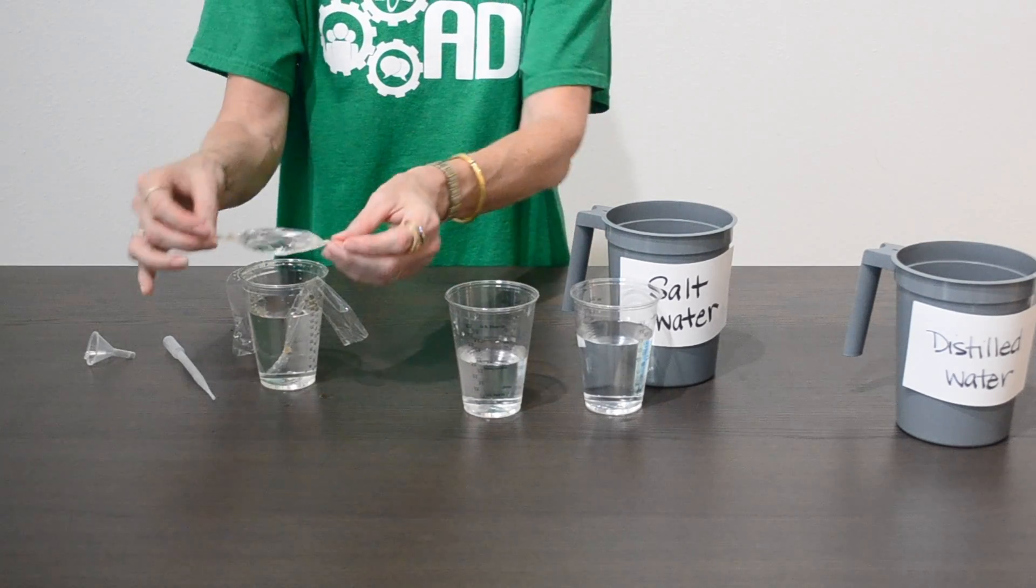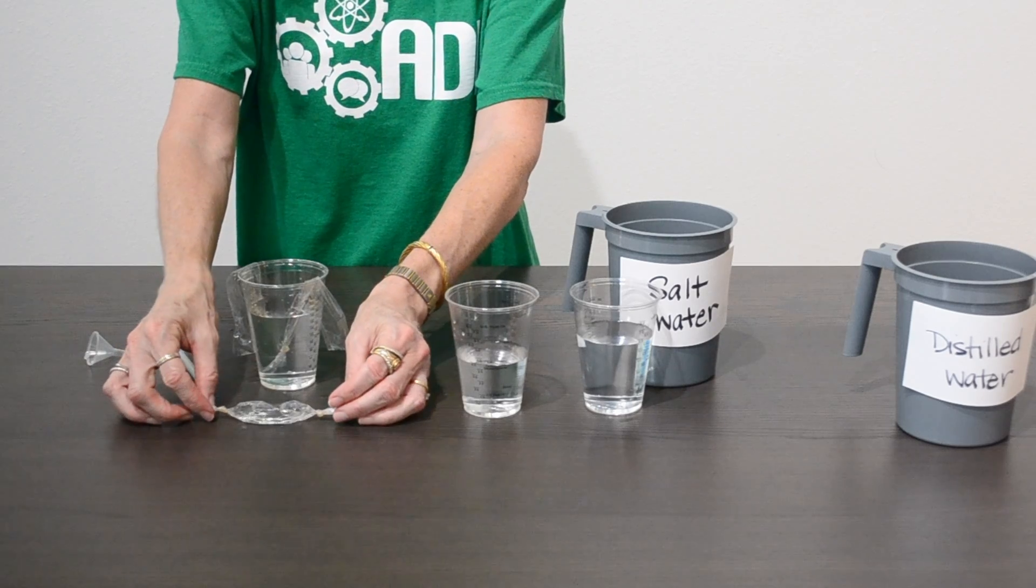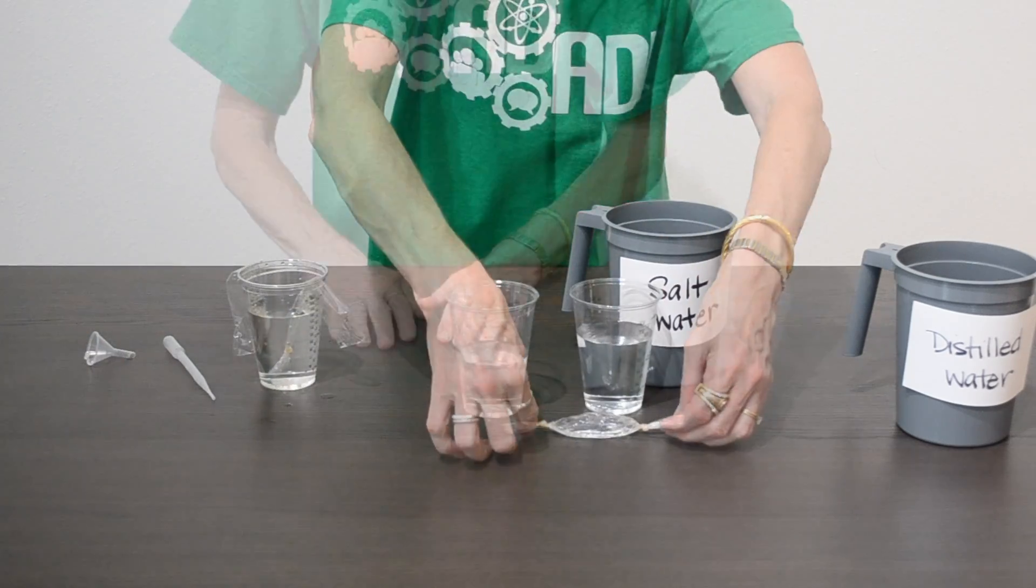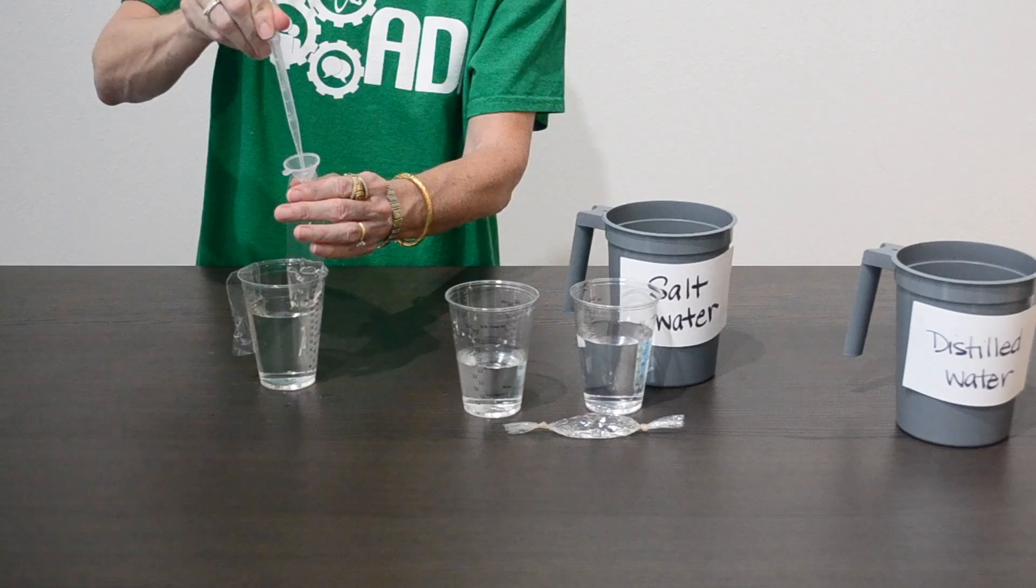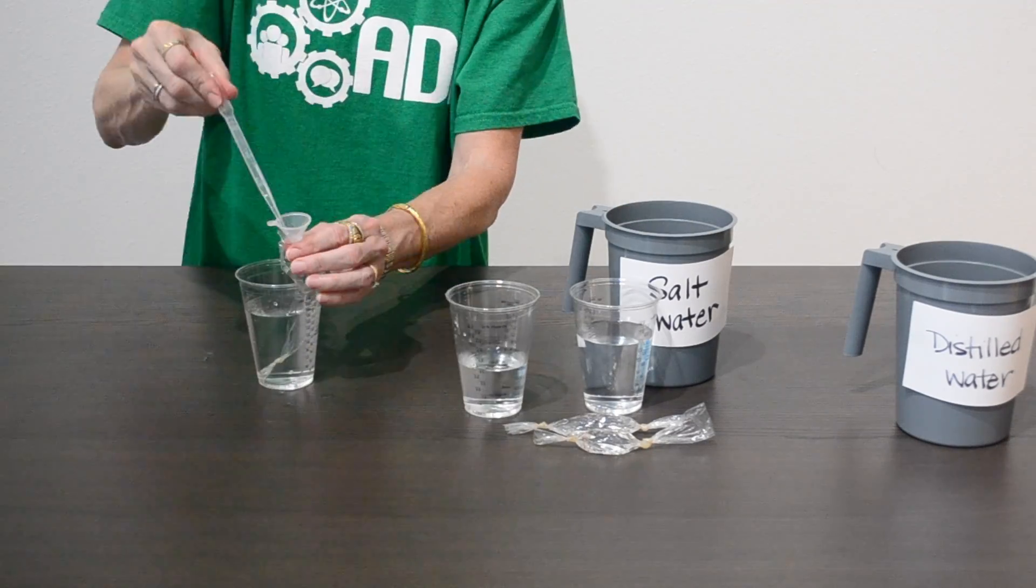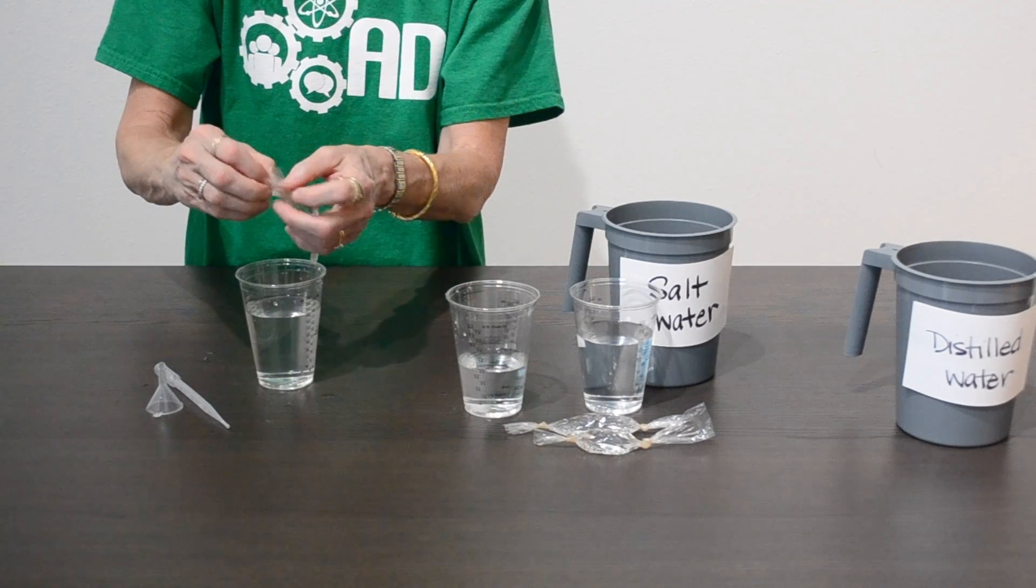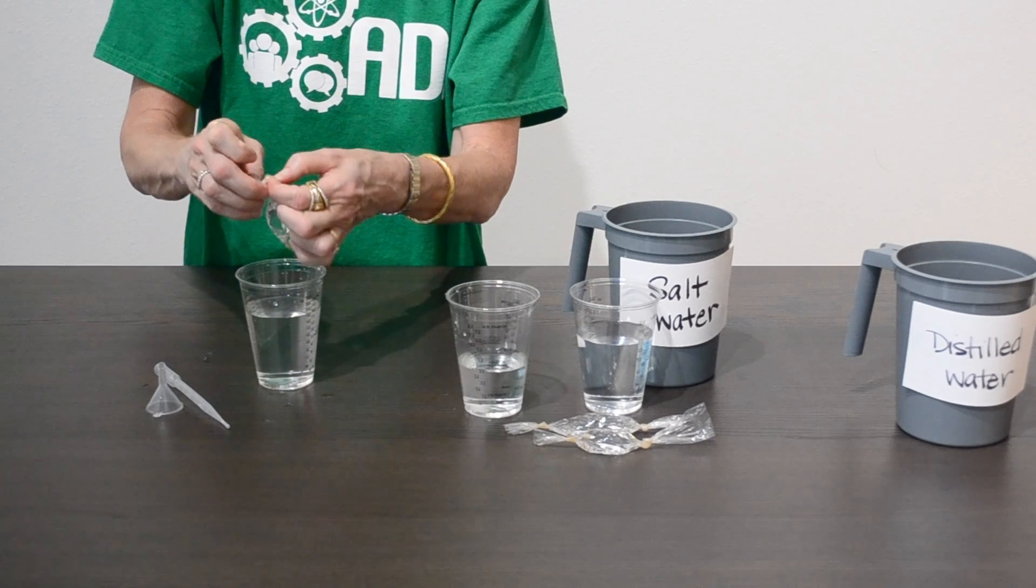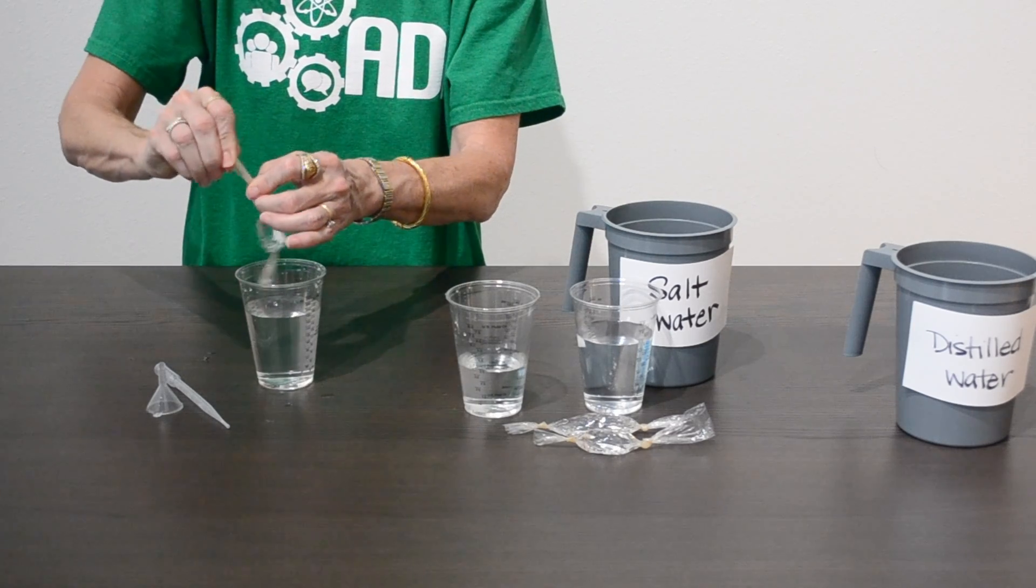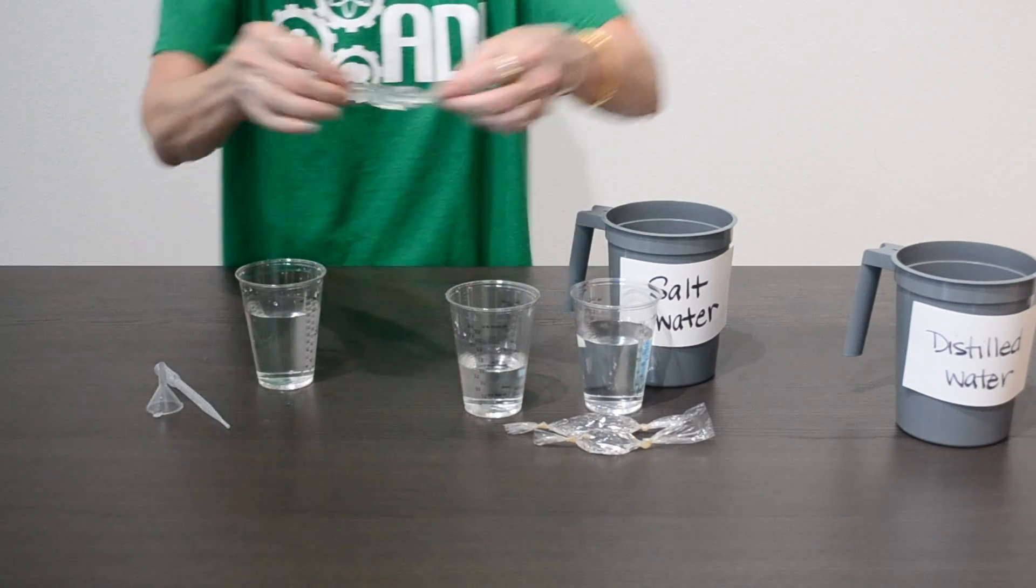Once you have this first one made, you're going to repeat this process with the other two pieces of tubing. Your student groups will now have three cells to use in their investigation.